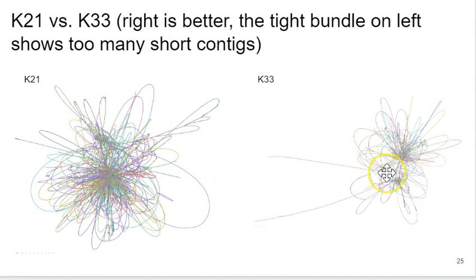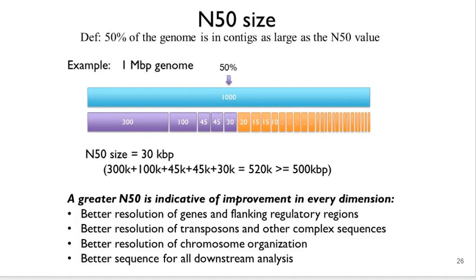Bandage output can also be used to optimize your assembly parameters. For example, you can be more specific in SPAdes about which K-mers you want used, then compare assembly results. Anytime you see a knotted-up ball in the graph, the assembly hasn't gone as well as when you see longer contigs with fewer knotted areas. A tangled graph on the left is poorer quality than a cleaner graph on the right.